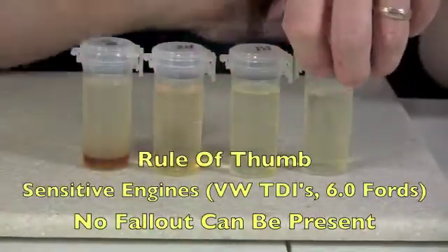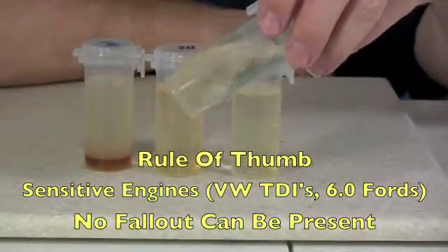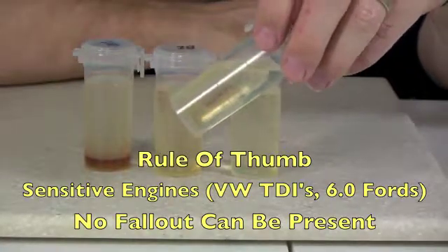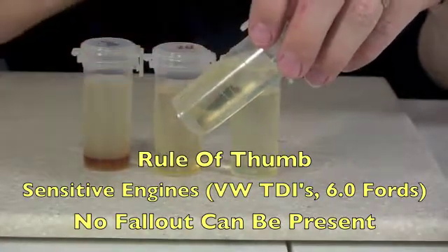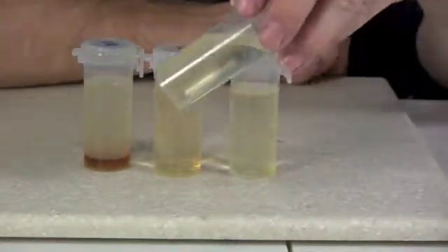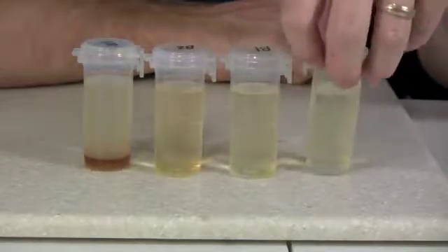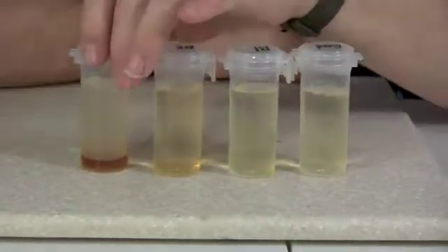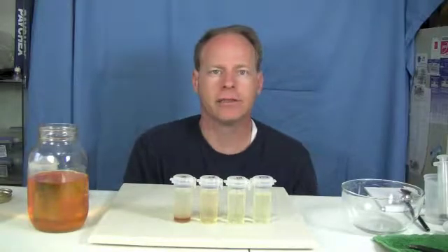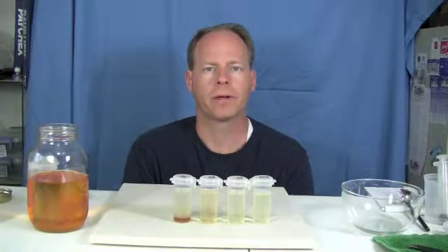And then if you've got a really sensitive engine such as the Ford 6.0 liter, or the TDIs, or anything much newer, you really want to pass. To pass this test thoroughly, you really want a fully reacted batch. So this is an example of the 3-2-7 test — a really nice test that you can do to see if your fuel is well reacted.